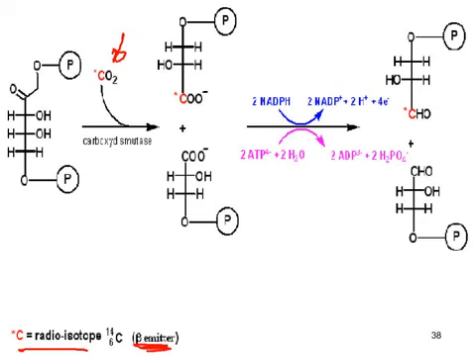And it works because C14 is a beta emitter. So if you have a device that picks up beta emission, you'll be able to detect which particular sample it's showing up in.